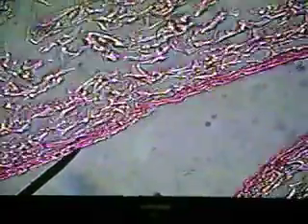Well, let's look at another one. Maybe it's not too bad. It doesn't look really too bad. So there we can see the wall of a vein. The surgeons, when they go in to operate, are very careful of these veins, especially the inferior vena cava, because if we accidentally tear into a vein like this, then we're in serious trouble.